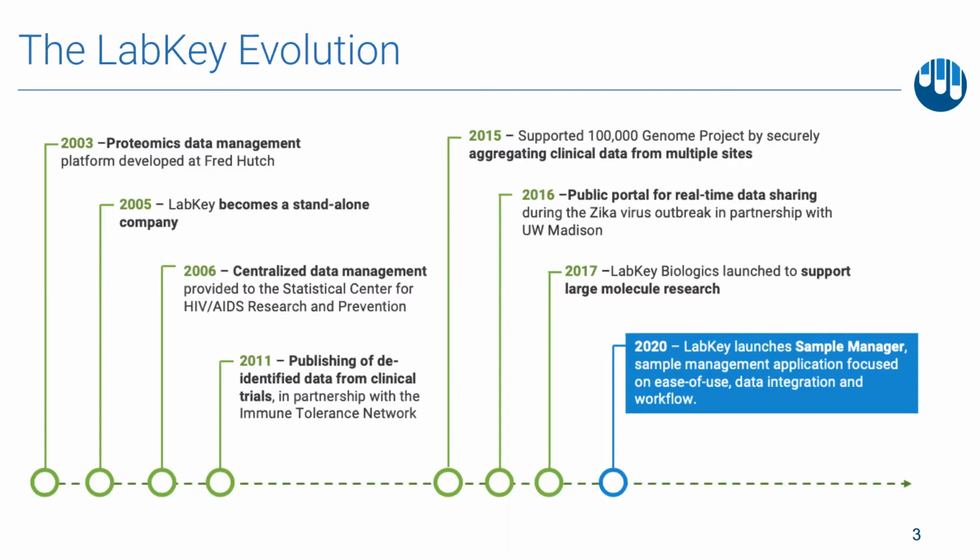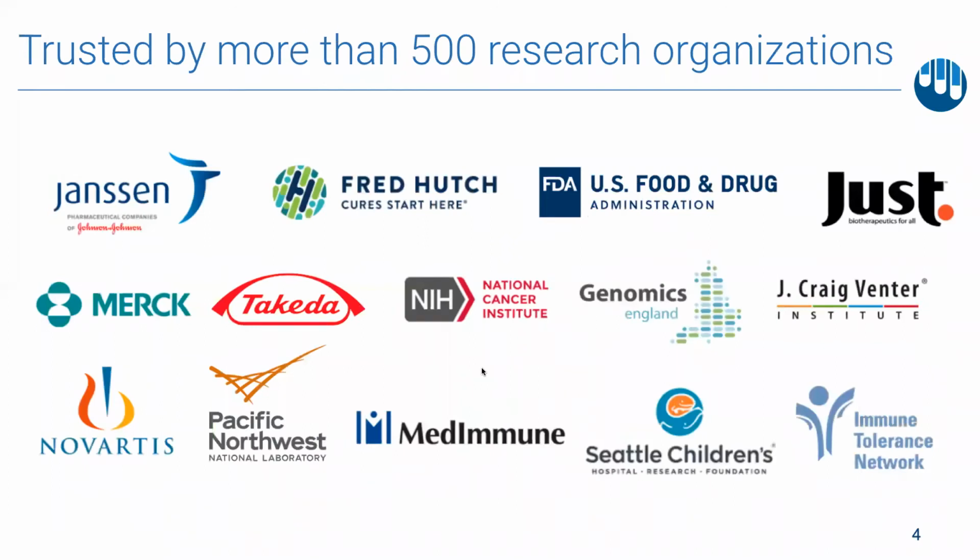We then launched our large molecule biologics development product with Just Biotherapeutics. And about 2 years ago, we started to investigate options for developing a new product that would serve both current and prospective clients, Labkey Sample Manager. As you've heard and as you can see here, we partner with a large variety of groups across scientific disciplines, which conveys the flexibility of our platform overall.